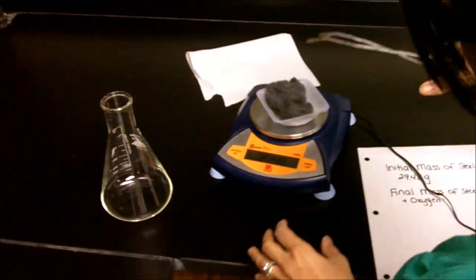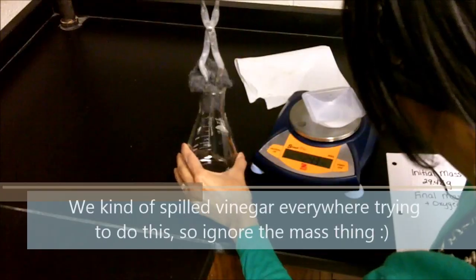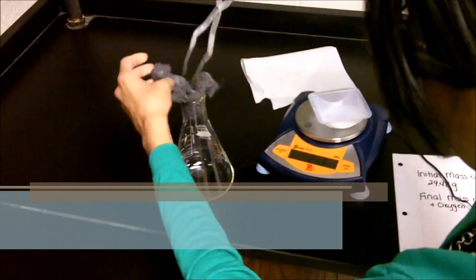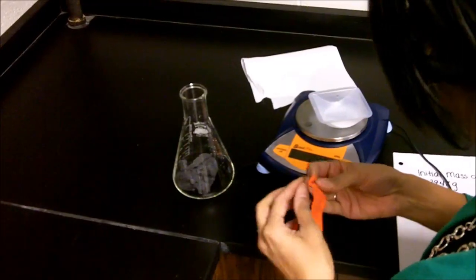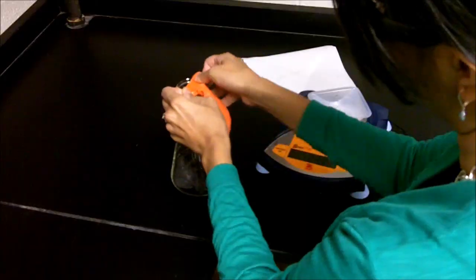We're going to go ahead and place the steel wool in the Erlenmeyer flask and place the balloon on top. From there, I'm going to let it just sit and see what happens when it's in the presence of air.